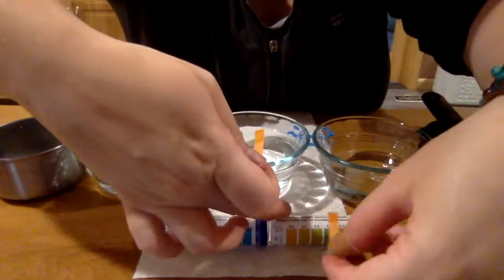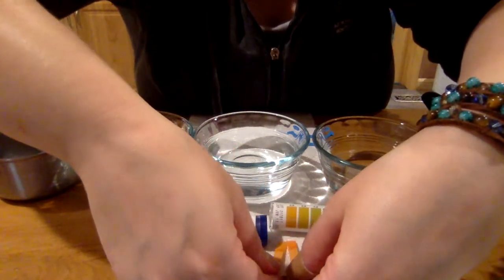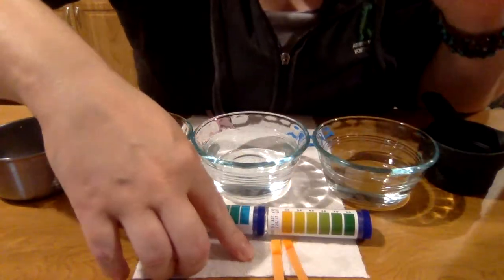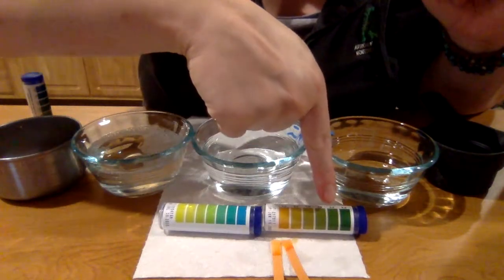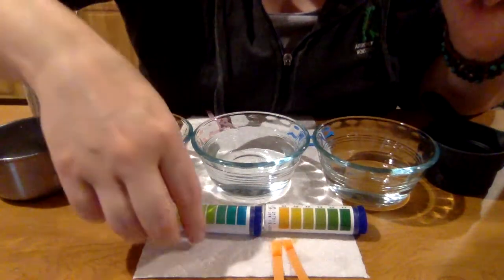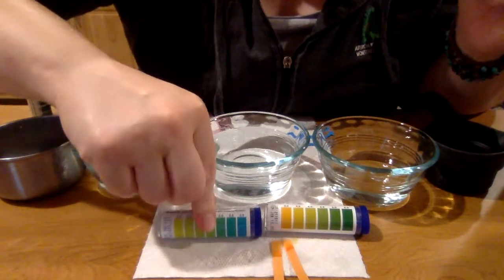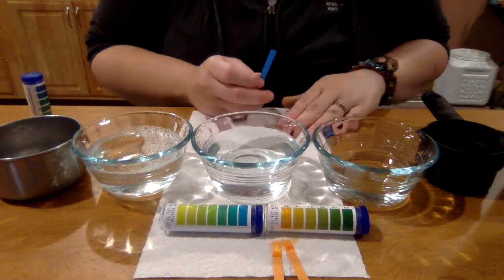Okay, so they're both kind of close to 3, as you can tell. So since 3 is right on the edge, I'm going to test the other one as well. Now, if these turn more of a greenish color, I wouldn't need to test further because that would be a clear indication that it's somewhere around 4.5 to 5.5. But since they're not, they're more along the lines of 3, which is right at the end, I'm going to come over to the stronger acid paper and see where they might be along that one.